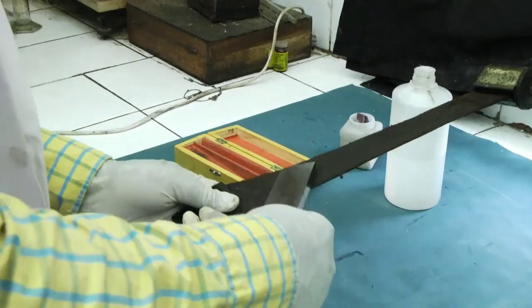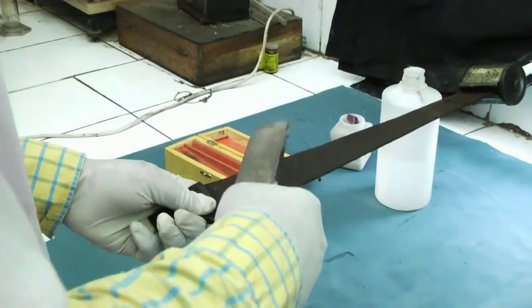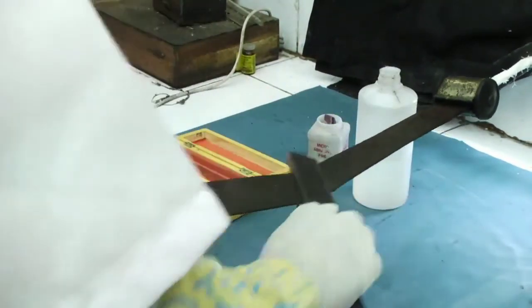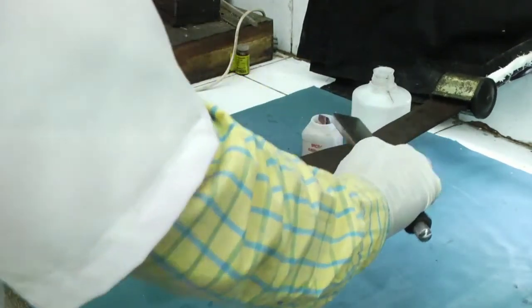inches. Technique: the knife is laid on the near end of the strop with the cutting edge towards the operator. The knife is held with the forefinger and the thumb. The action is the exact opposite to that of honing.